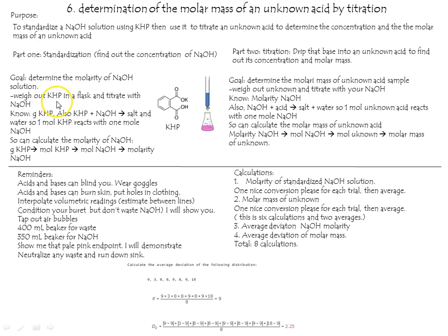We'll neutralize it with an acid known as KHP. That stands for potassium hydrogen phthalate. That would be phthalic acid if it was two CO2H's, but one of them has already been neutralized. So you still have an acid right there. That H is the acidic proton there, and it'll just react with one equivalent of sodium hydroxide.